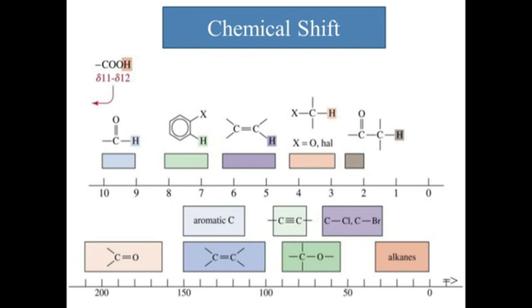So why does proton have 0 to 10? Because proton has 100% natural abundance, so it takes a minimum of about 52 seconds of spectrum scanning time. So we can collect how many protons are present in your molecule.